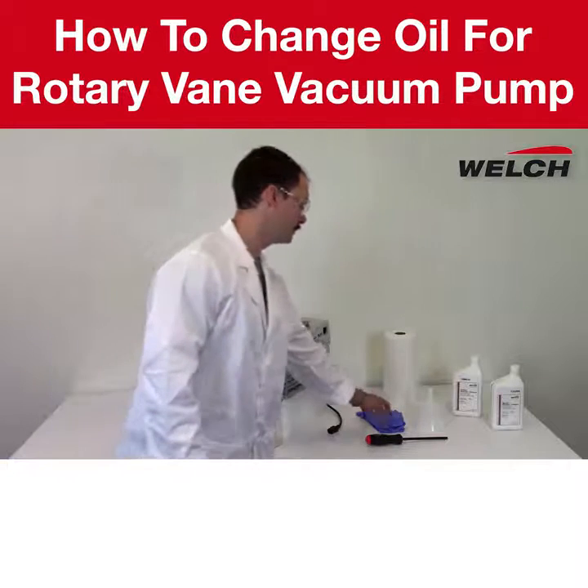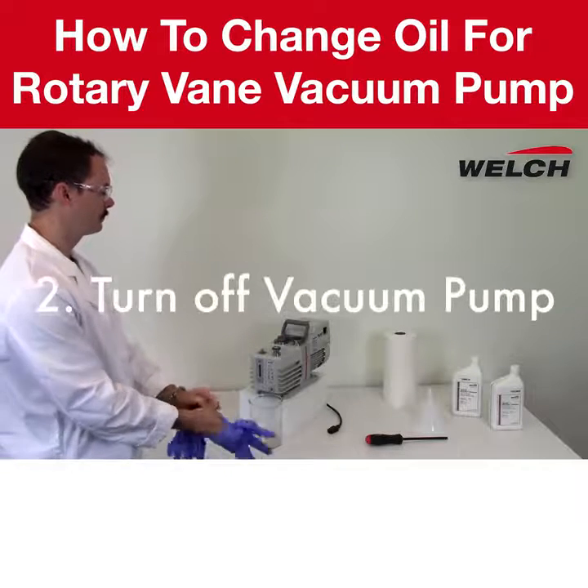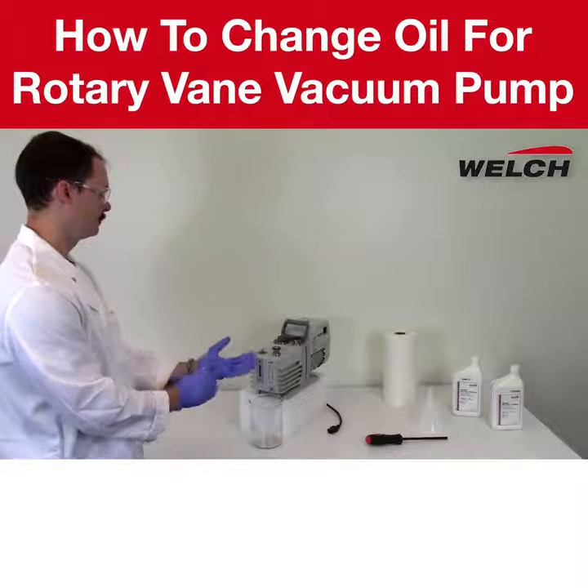Safety first. Please make sure you are using the proper personal protective equipment and that the vacuum pump is turned off and unplugged. For this demonstration, we are using safety glasses, rubber gloves, and a lab coat.